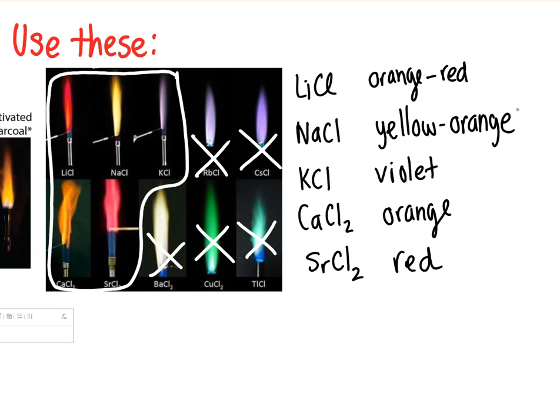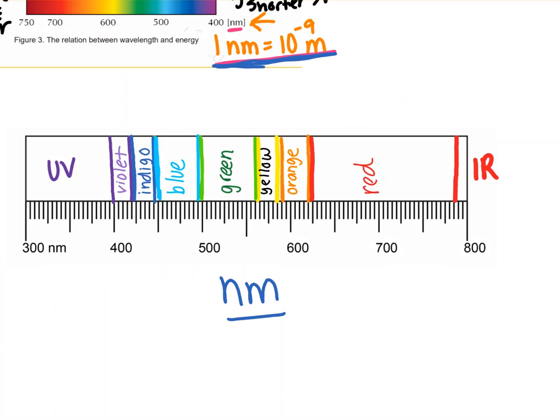For its wavelength, I would go to my chart where I label it and go to the transition between yellow and orange. Let me show you. Just say you needed that wavelength for yellow-orange, I would come in right here at this transition and read off something. These are rough numbers, so don't worry about that too much, but they should be in the right range. Make sure that you look at what the scale is on here, like what each line represents. It's not what I thought at first.